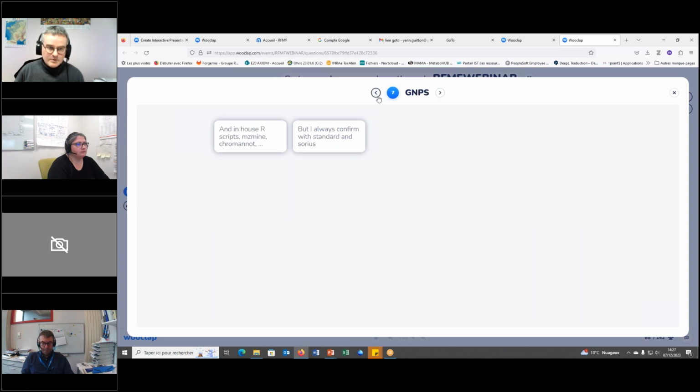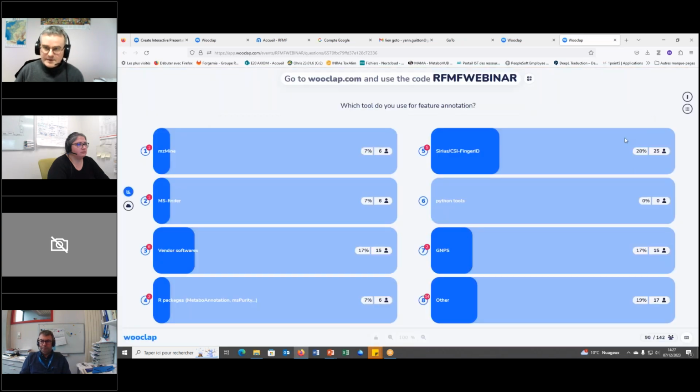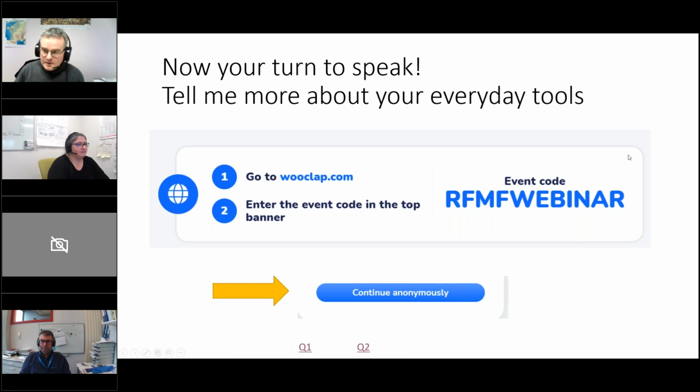Okay, and then MyCompoundID. Yes, confirmation is standard. No, not a lot of Python. Okay. GNPS for sure. MetGem for networks. Okay, great. Thank you all for that. So it's good to see that most of the tools the community is using are in my talk today. Great. I'm happy with that.